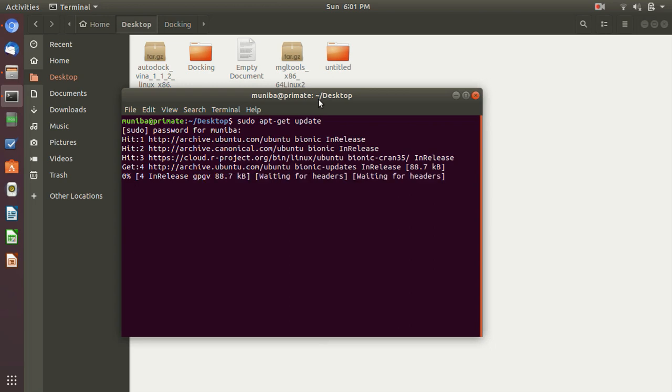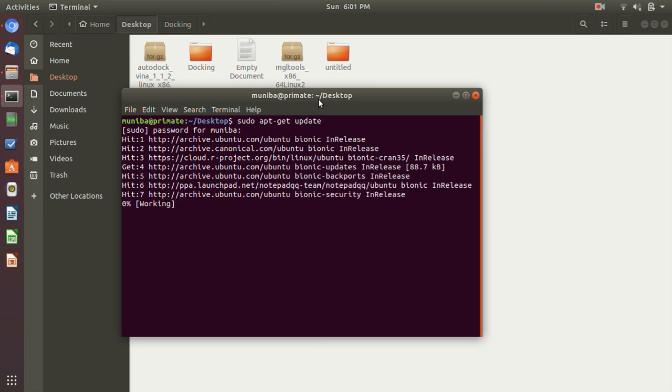So let's first open the terminal. Let's update our system. First, it is a good practice if you are installing new software packages, you should update and upgrade your system first. So first we are going to update it and then we will upgrade our system.